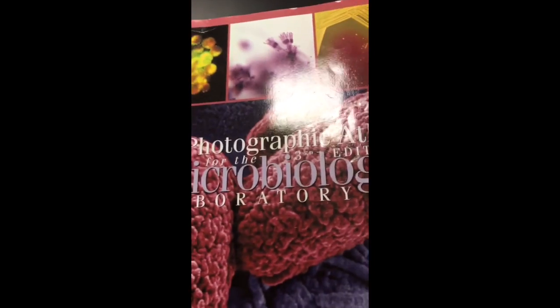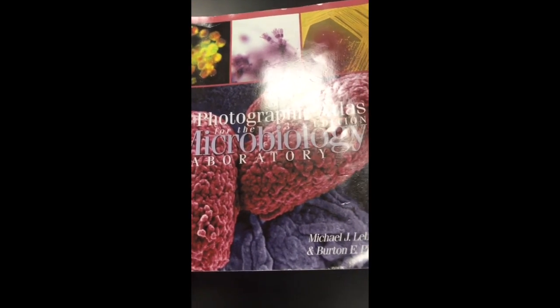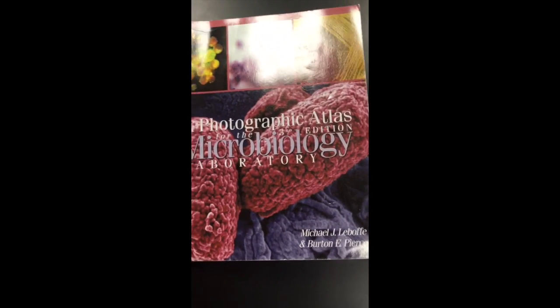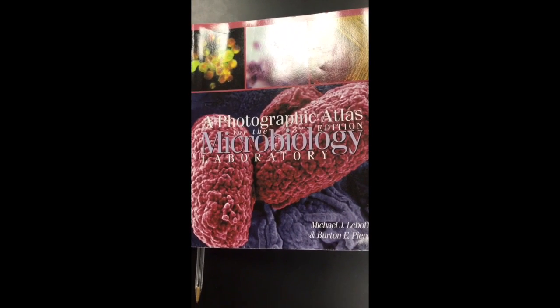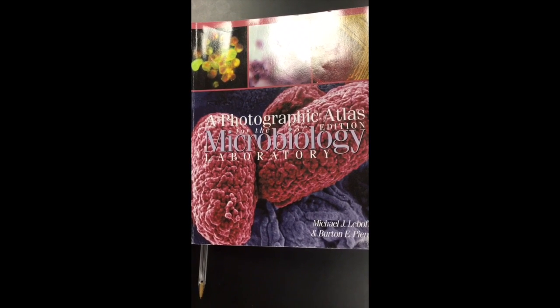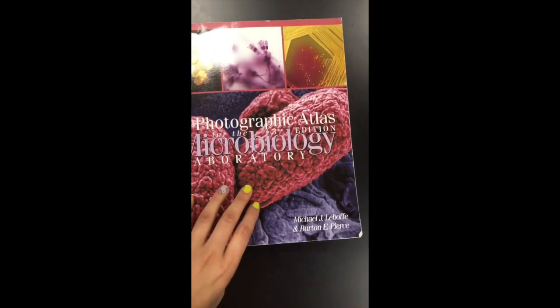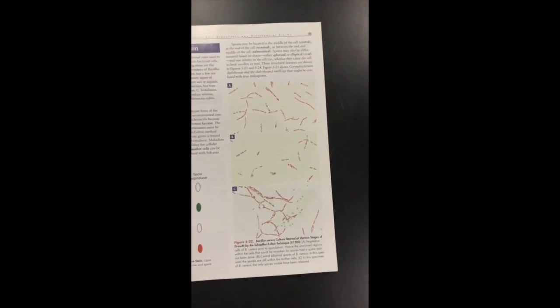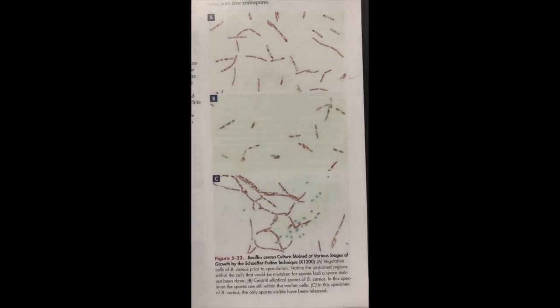And there you have your endospore stain. This is what your slide should look like once you have properly gone through the procedure of making an endospore stain. We're not going to look at it through a slide today, but we are going to use this book to help us see what it should look like under a slide. So this is a photographic atlas for the microbiology laboratory, third edition. We're going to turn to page 41 and look at figure 5-22.